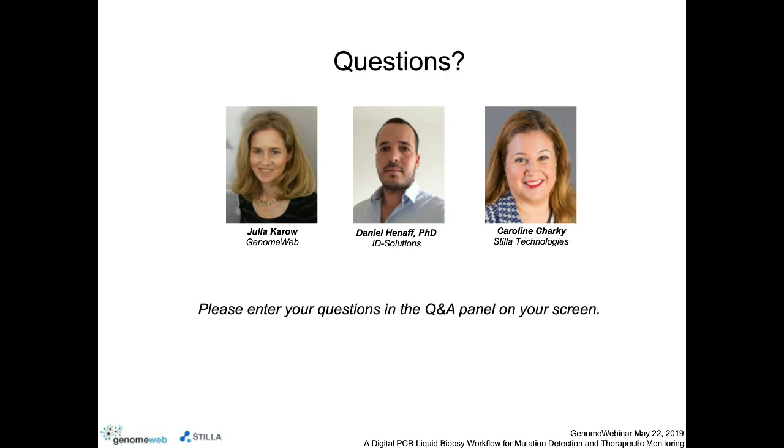Question probably for either of you. Do you see any potential of digital PCR for non-oncology applications, for example, in infectious disease? Yeah, of course. Right now this talk is focusing on oncology, and we see that in the digital PCR field, oncology publication is driving the field, but in terms of potential application in life science, it's sky's the limit for digital PCR.